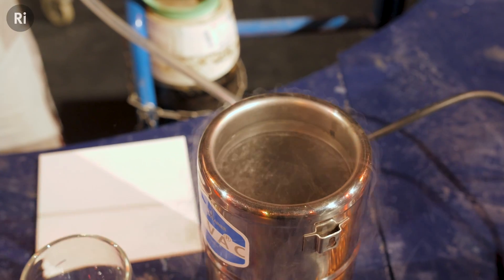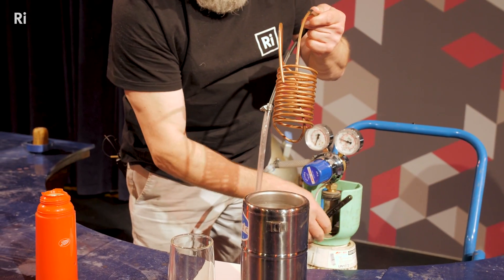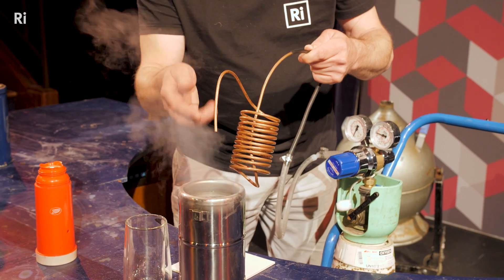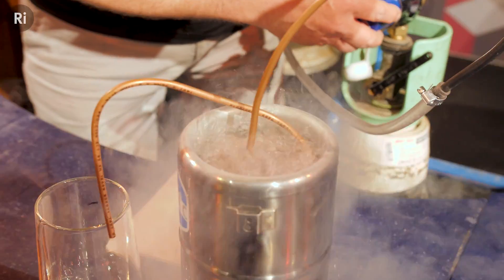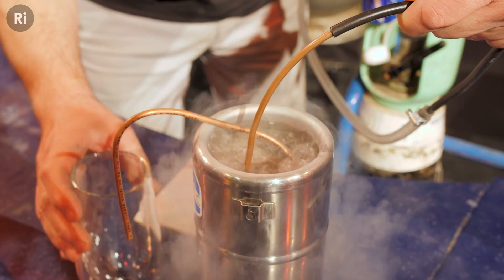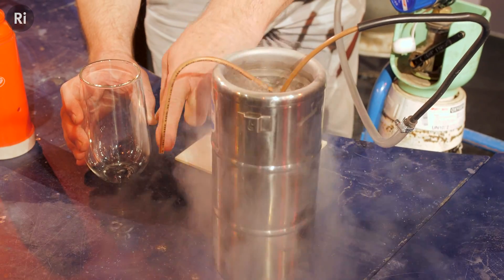Why do we need liquid nitrogen at minus 196? Well, we need to pass oxygen through the liquid nitrogen and that should cool it down. You can see the oxygen is blowing the vapour away. We haven't got any liquid oxygen yet because we need to cool that oxygen down, so I'm going to submerge it in the liquid nitrogen. You can see the heat of the copper coil and even the heat of the oxygen gas is enough to boil the liquid nitrogen a bit more, and I can rest that in there now.